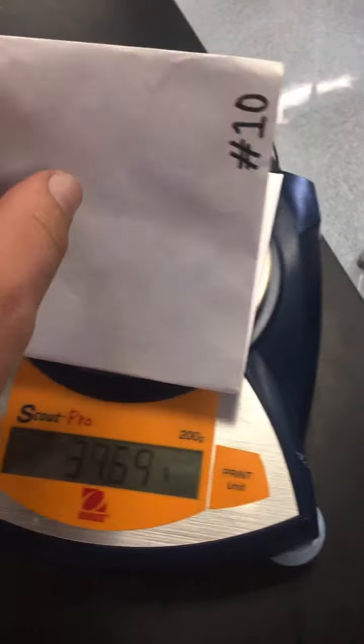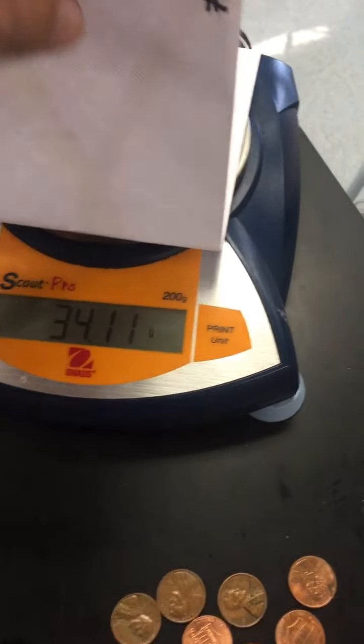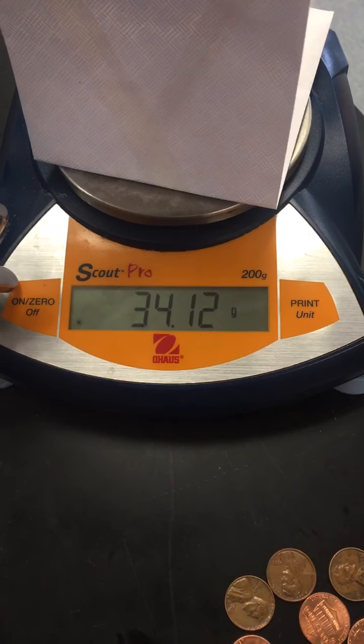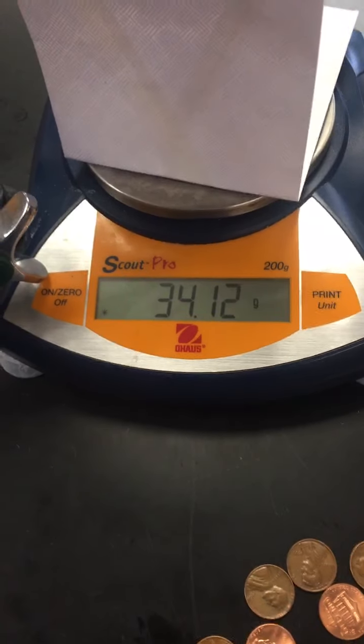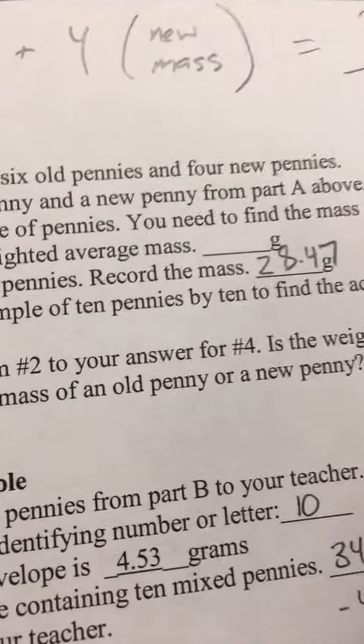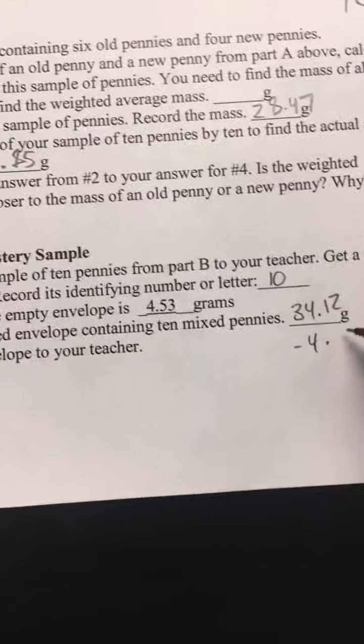It's on the scale. It weighs 34.12. Now what you're going to do is subtract the total mass minus the number here, because that is the weight of the envelope.